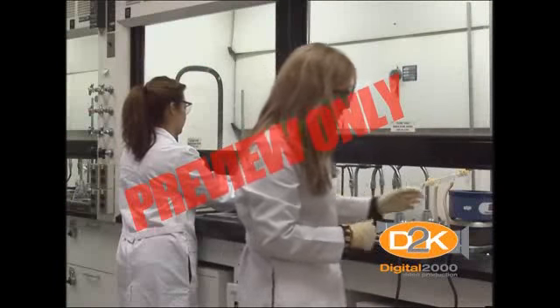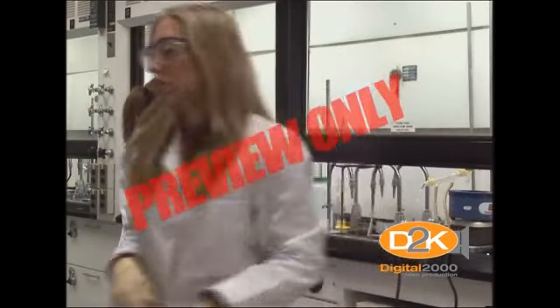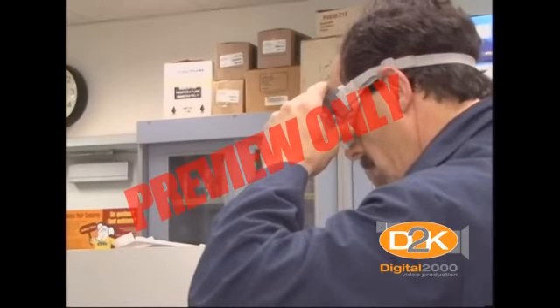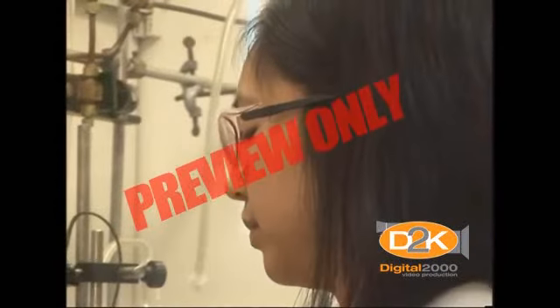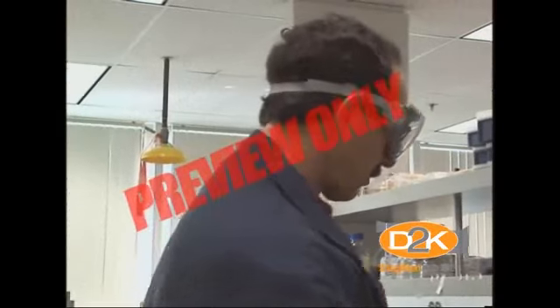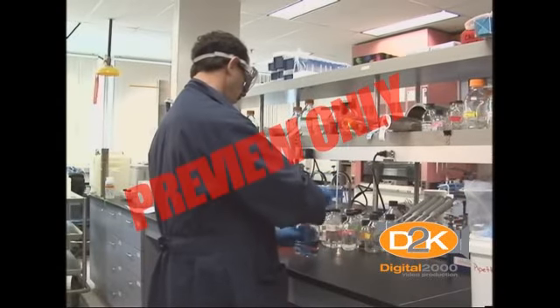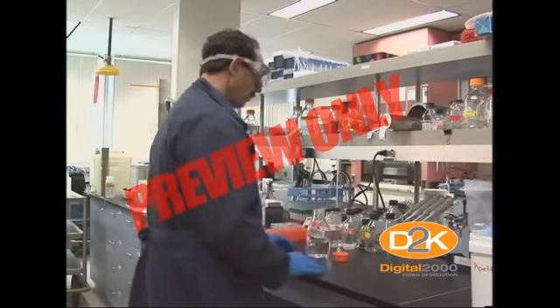Eye protection must be worn when working with substances or equipment that present a hazard to the eyes. Safety glasses and goggles should fit securely and be free of smudges or scratches that may obstruct vision. Safety glasses equipped with side shields provide more complete protection. In addition, safety goggles provide an increased level of protection. Safety goggles should be worn when chemical splashes could occur or when glassware is being used under pressure.